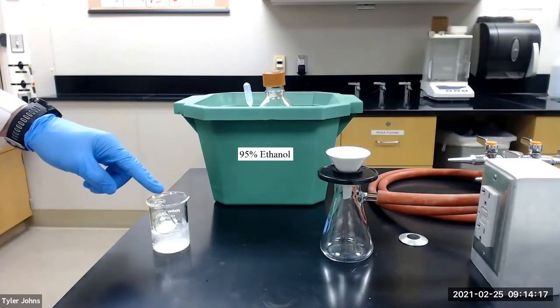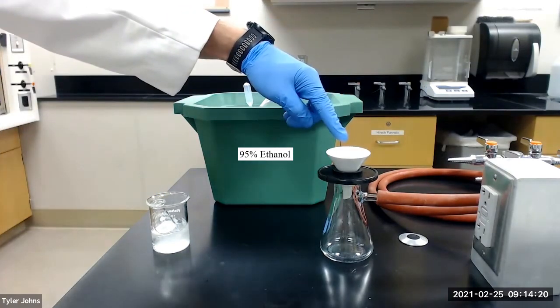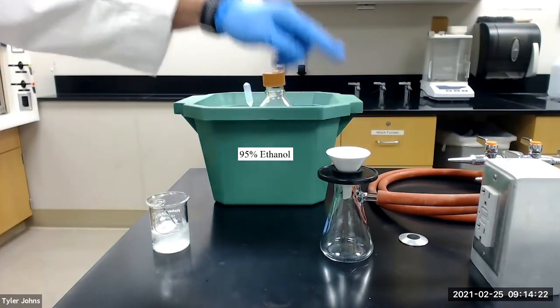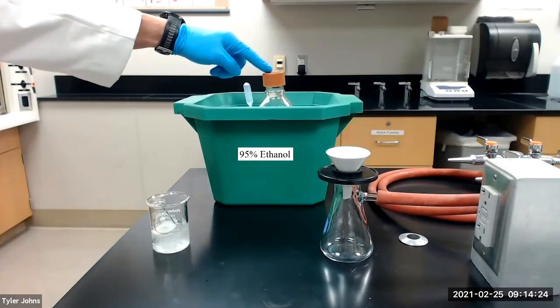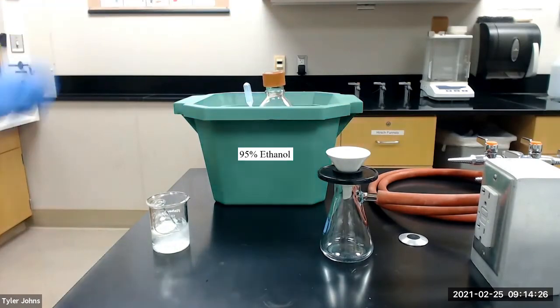After crystallization is complete, we will collect the crystals by vacuum filtration on a Hirsch funnel. We will use ice cold 95% ethanol to aid in the transfer of the crystals.